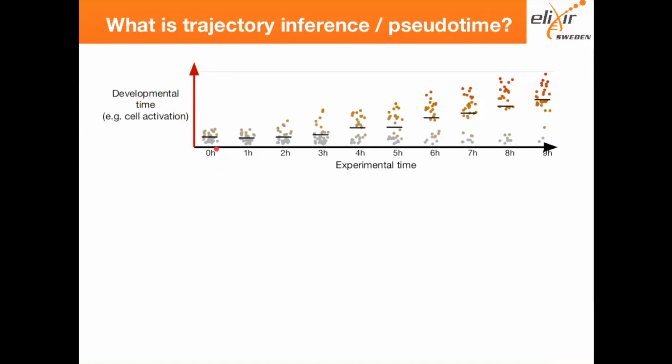And let's imagine that you have cells in vitro that you put any stimuli to induce their differentiation to another cell state. And then over time, some of them will start completely the differentiation path until here. Then you can see they are completely differentiated. And some of them will be somewhere in the middle. Some of them will not differentiate at all. So these processes, even though you have quite homogeneous cell populations, they all will not differentiate exactly at the same rate and at the same time.